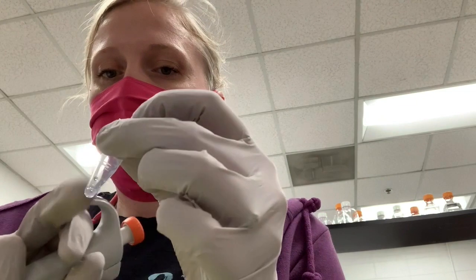Okay, so I've added my master mix to each tube, and now I'm going to add my template DNA to each tube. And you're going to need to use a different tip for each one because your templates are often going to be different. So I'm adding the template DNA to each tube. I'm going to give them a little flick to mix, and then I'll put them in the incubator.